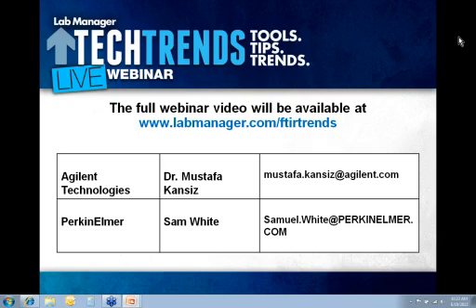We do have Ramans in several forensic accounts, and they're used, but I'd be hard-pressed to say that there's a killer application for Raman. Okay.